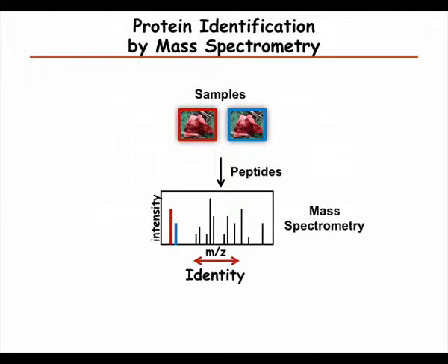Charges, you mean? If you have bigger charges, in MALDI, I haven't seen that. In electrospray, definitely. Even if you have a small protein, you can get those kinds of charges. In MALDI, I don't think I've seen much more than 15, maybe, for quite a large protein. Maybe you could get something bigger, but it's difficult to get that charge.